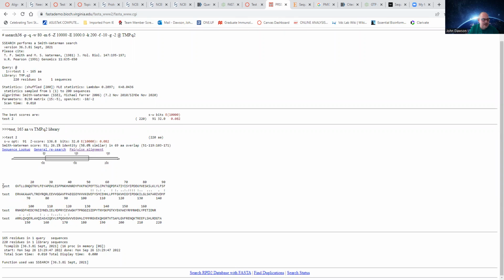So I was looking down here, and per our notes, looks like it's checking similarity as opposed to identity. It's not telling us what these proteins are, but it is showing us how similar they are and where the bases match up, either an exact match like here with the 2 dots, or with what I call a good enough match, say here between the H and the R with these little 1 dots.